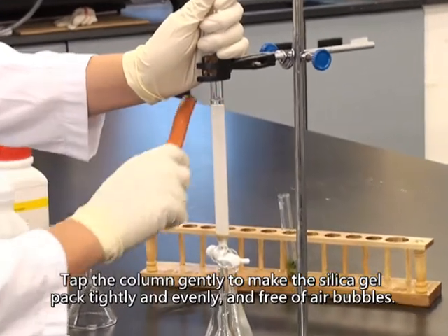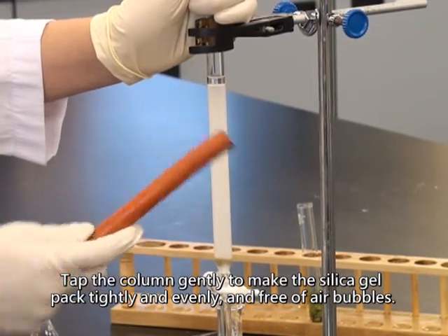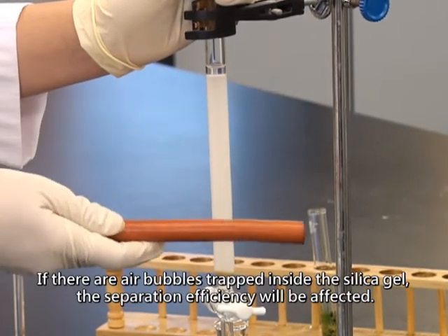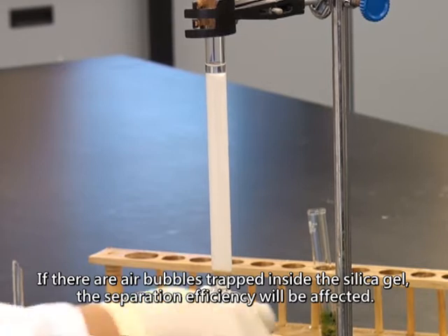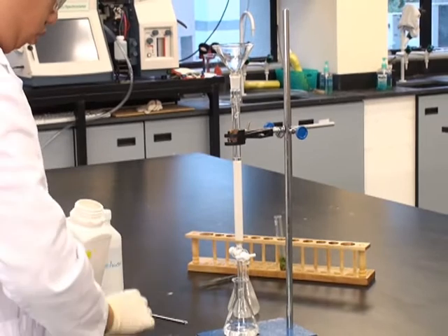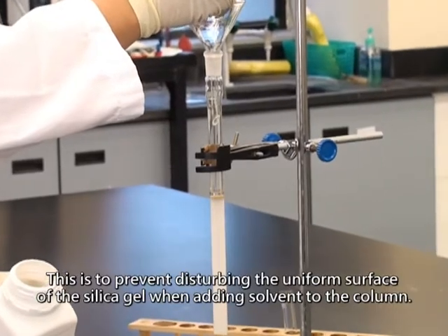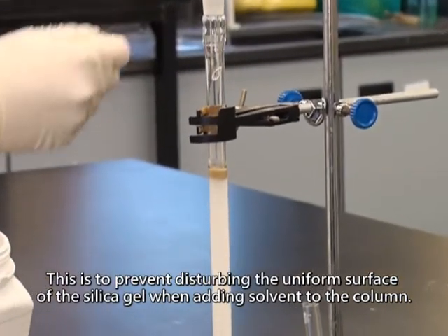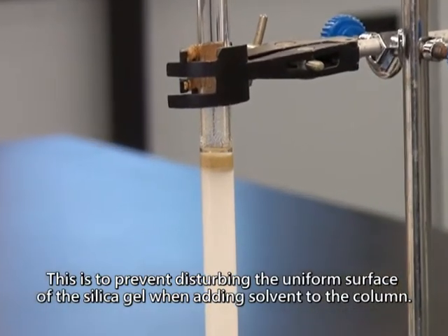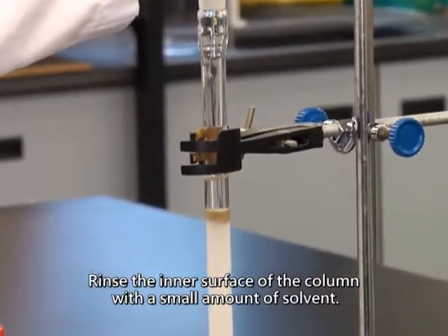Tap the column gently to make the silica gel packed tightly and evenly, and free of air bubbles. If there are air bubbles trapped inside the silica gel, the separation efficiency will be affected. Add a thin layer of sea sand onto the top of the silica gel. This is to prevent disturbing the uniform surface of the silica gel when adding solvent to the column.